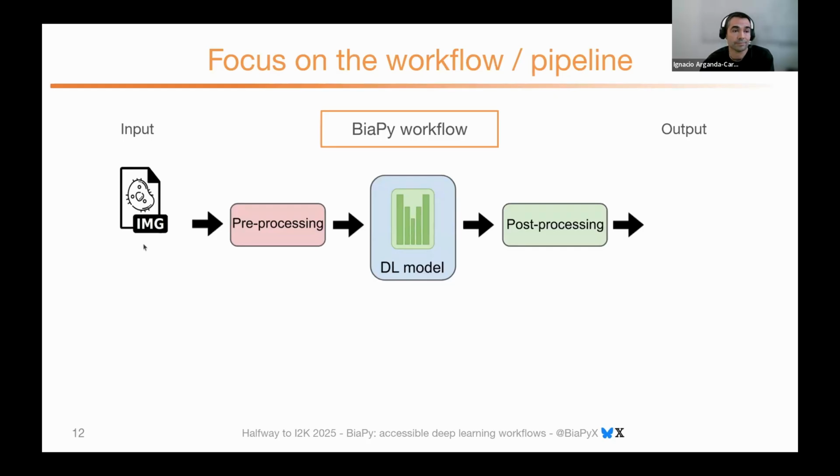As input, we always have images, but they could also come with some labels, depending on the task.